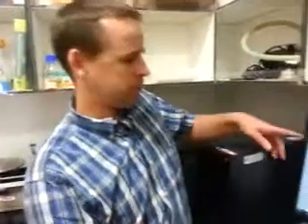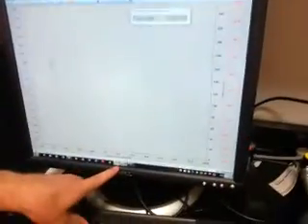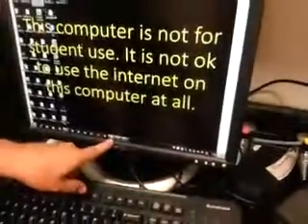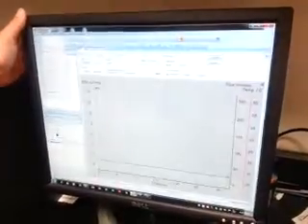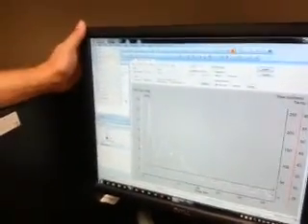Alright, so we're going to show you how to analyze the data that you collected on the calorimeter. Okay? So first of all, we go to this little button right here. Now, if this isn't up for some reason, the analysis software is this Proteus analysis link right here. Okay? So we bring it up, and you're usually going to start with nothing here.